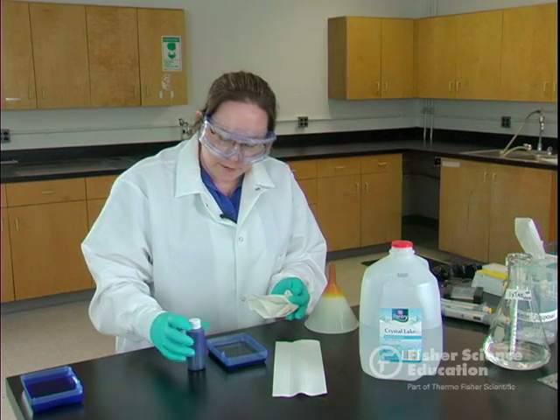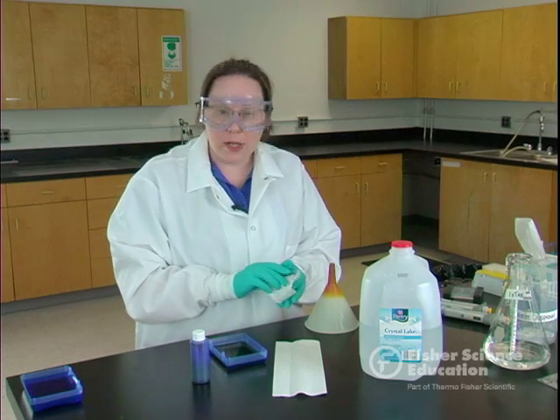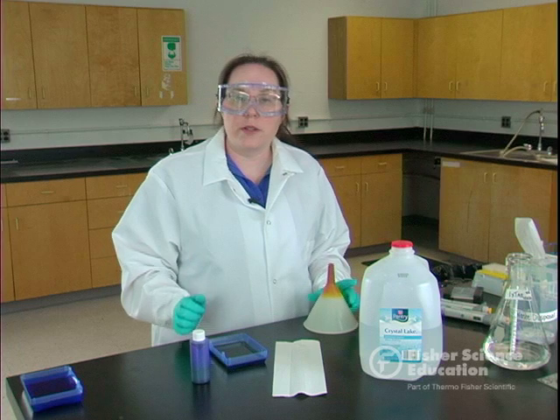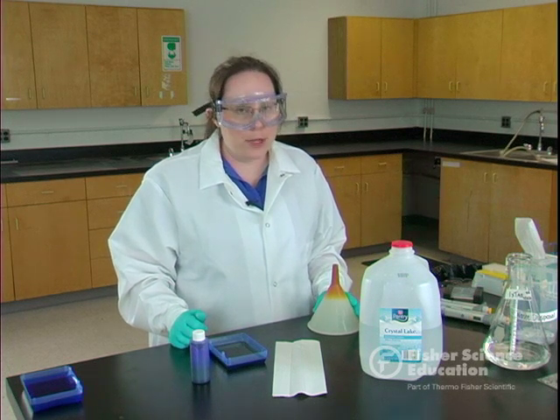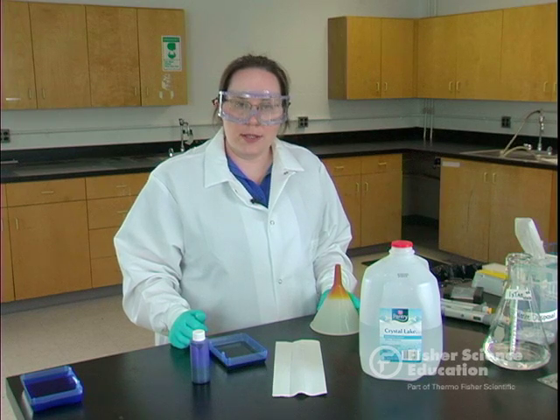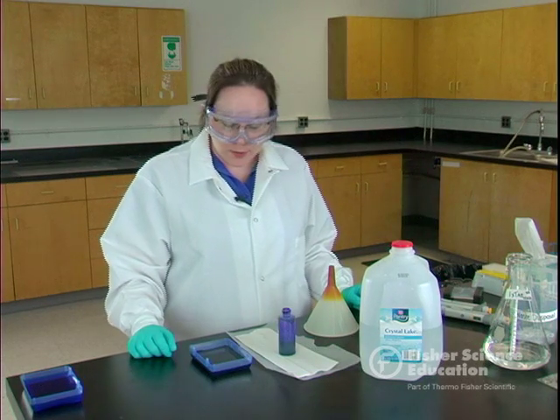This only needs to stain for five minutes because it's so concentrated. We're going to wait five minutes and then we'll de-stain so we can look at our results. De-staining takes approximately 20 to 30 minutes, and it's best if it's shaking. We'll go ahead and show you how to de-stain next.